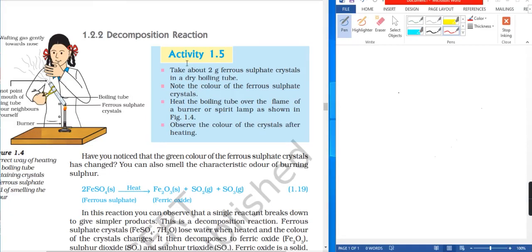Decomposition reaction. Activity 1.5. Take about 2g of ferrous sulphate crystals in a dry boiling tube. Note the color of the ferrous sulphate crystals.